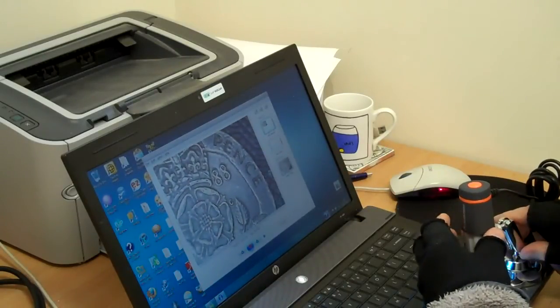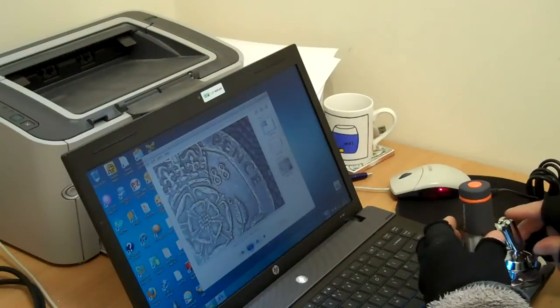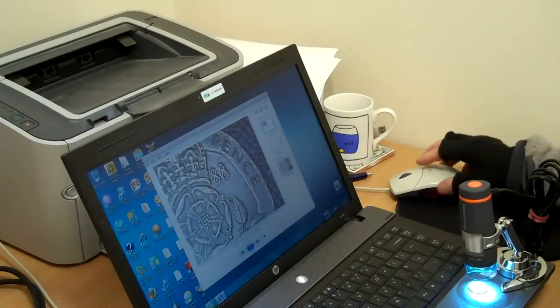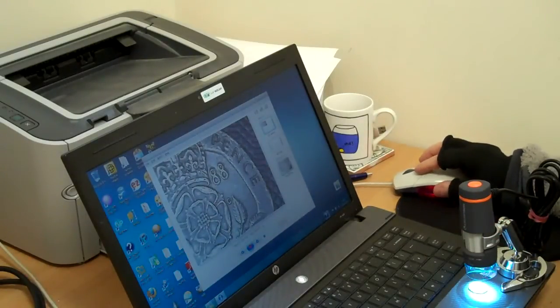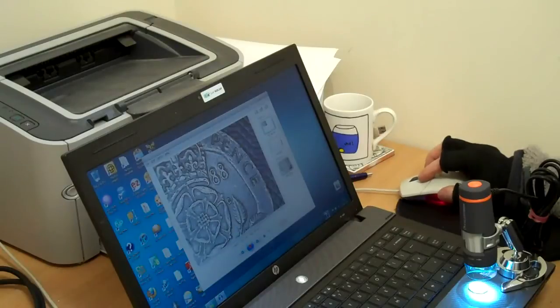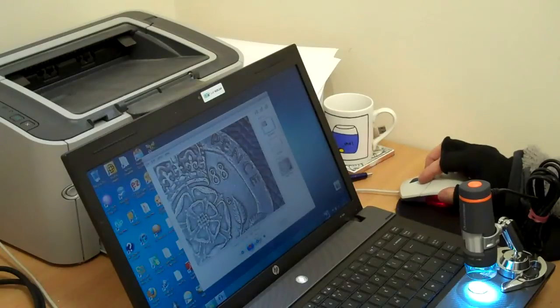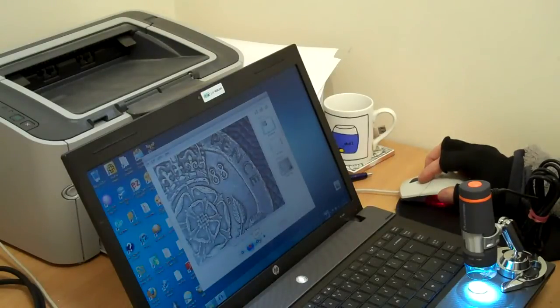And I can take pictures through the software as well. Either by clicking once for the same kind of snapshot as I've already got, or I can take what's called a burst of 5.